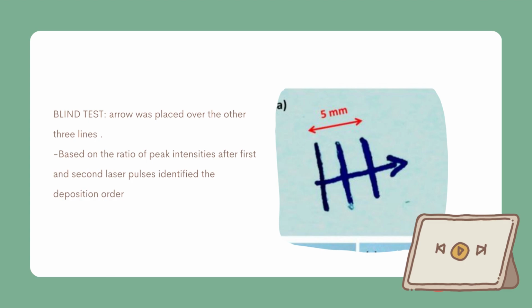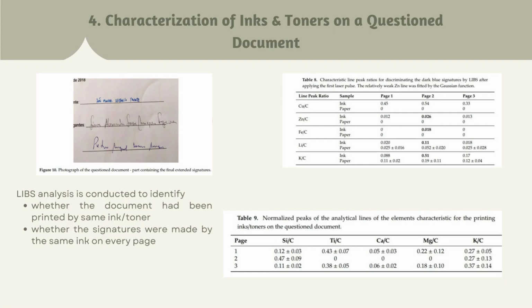One of them was identified correctly by using PCA analysis, while the missing answer could be attributed to locally very thin ink layers compared to the laser ablation depth.